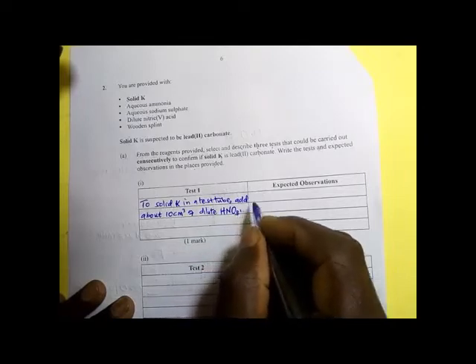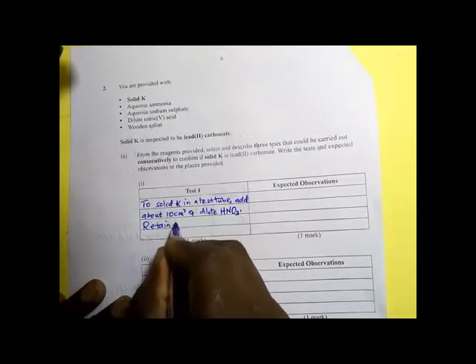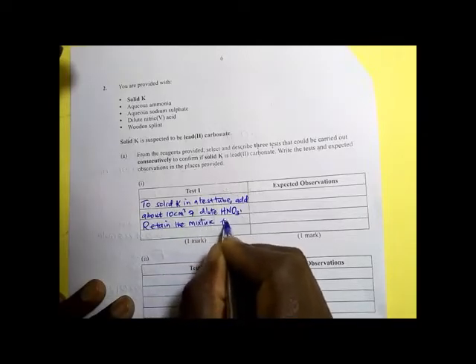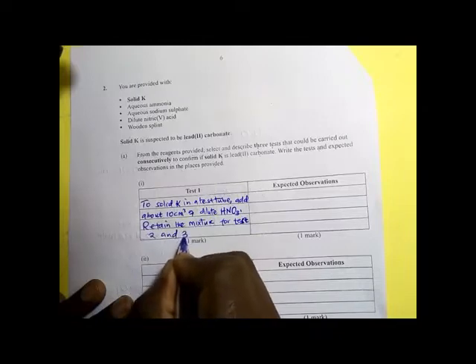And then you retain the reaction. So you should tell that they retain the mixture for tests 2 and 3.